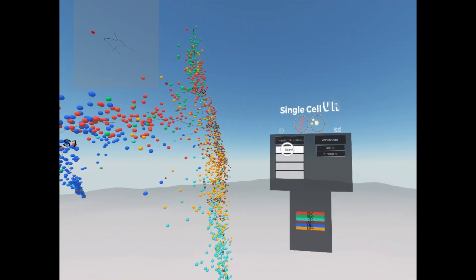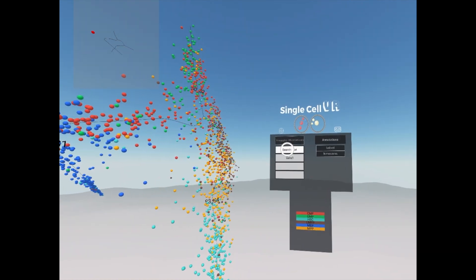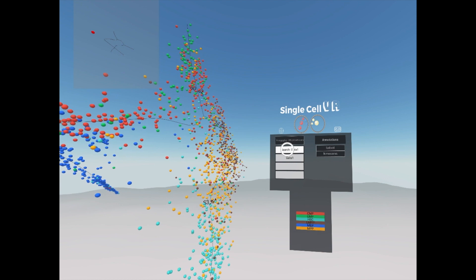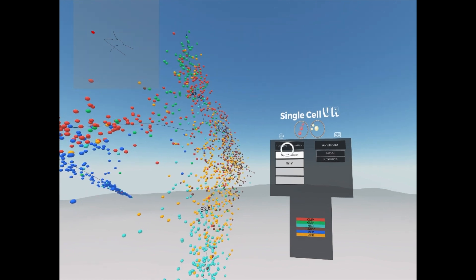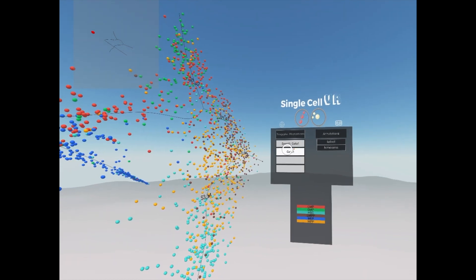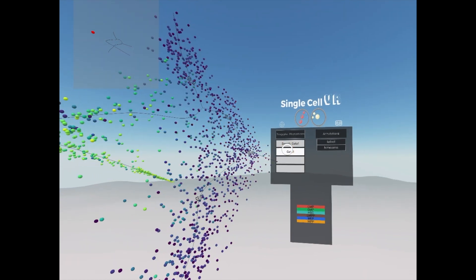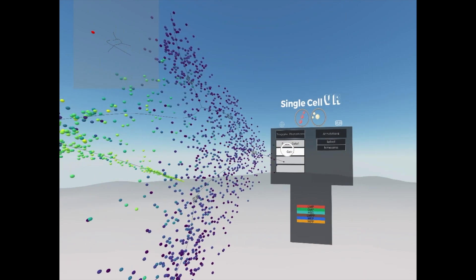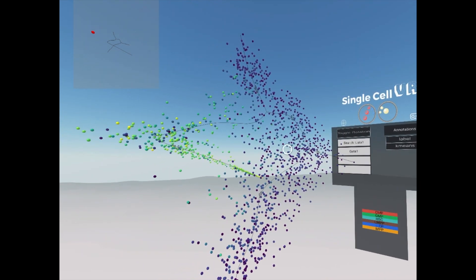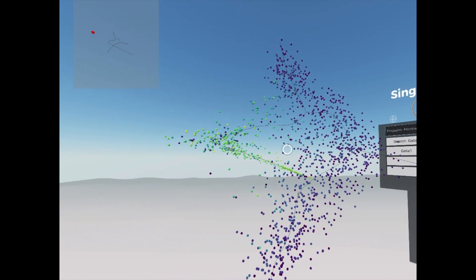We can navigate to the menu and use the search bar to find a gene of interest. Once we have a gene — GATA1 in this example — we can color the cells by differential expression.